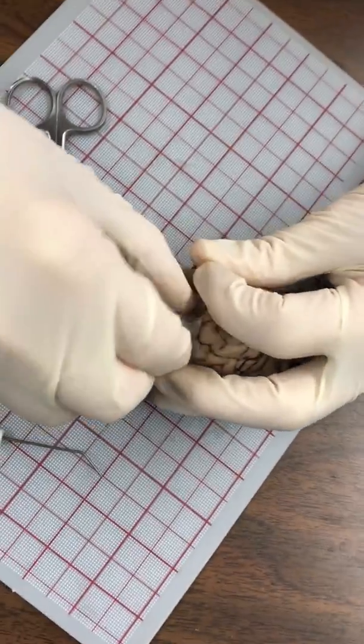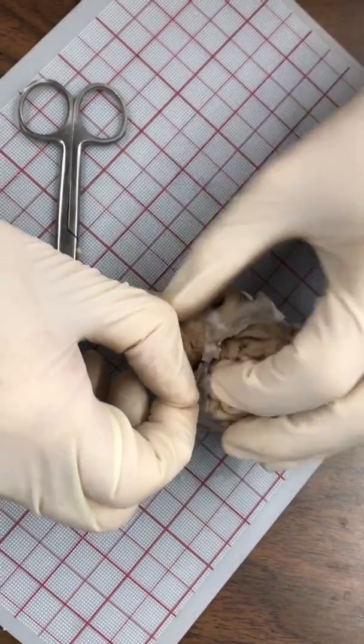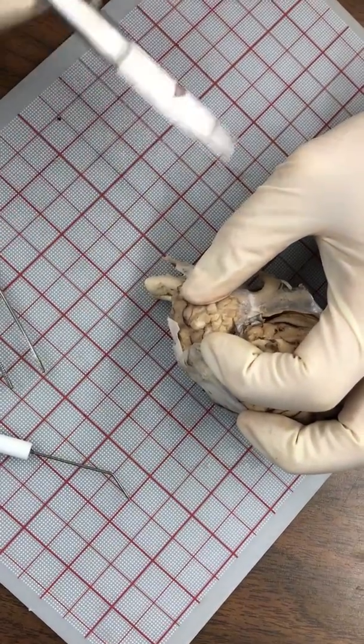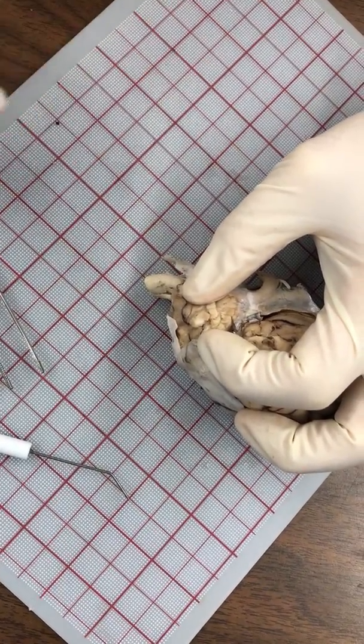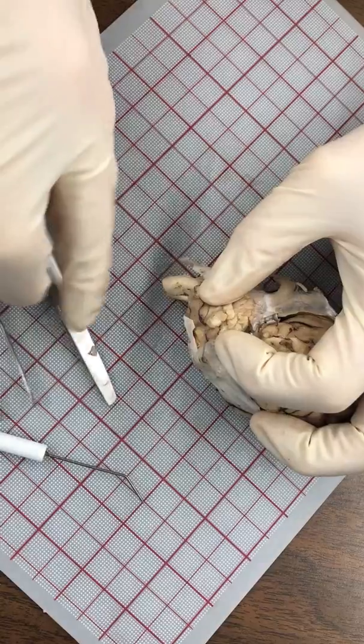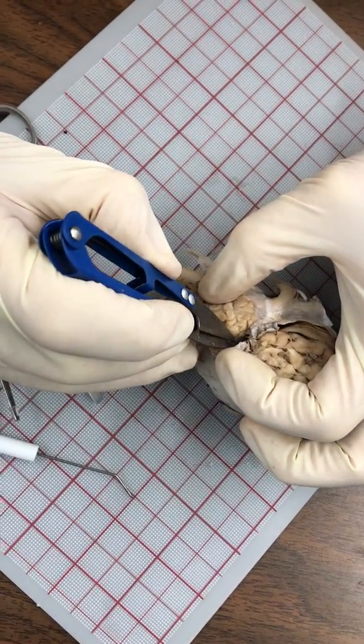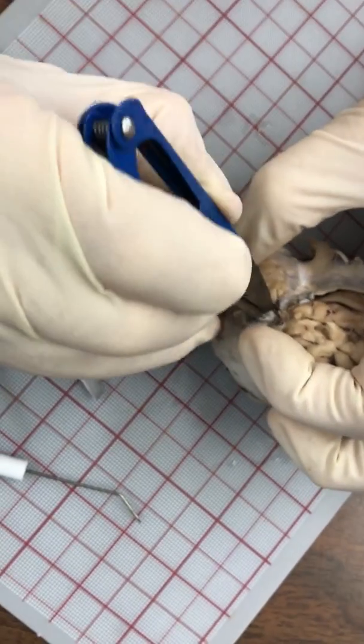This is where your partner is really going to help you out by holding the brain apart so you can get down in there. Let's see if we can do it with these sewing scissors — they allow me to see a little bit better in there, which is why I like using them for this part.